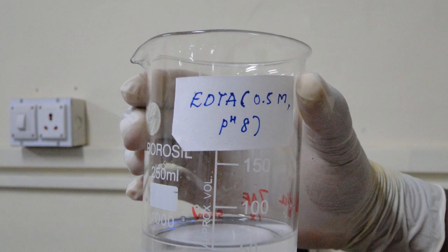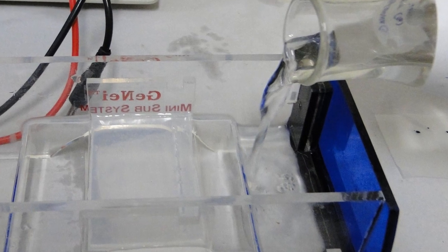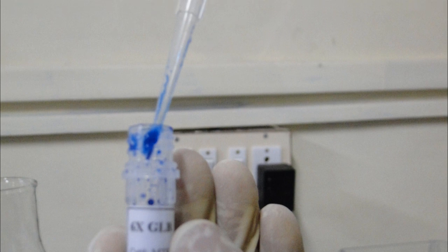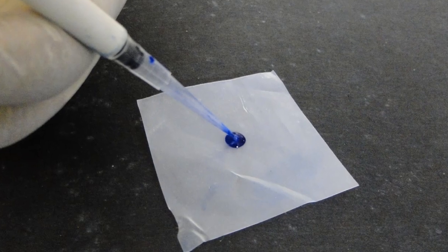Electrophoresis buffer, which is usually Tris acetate EDTA or Tris borate EDTA. Loading buffer, which contains something dense like glycerol to allow the sample to fall into the sample wells, and 1 or 2 tracking dyes which migrate in the gel and allow visual monitoring to indicate how far the electrophoresis has proceeded.